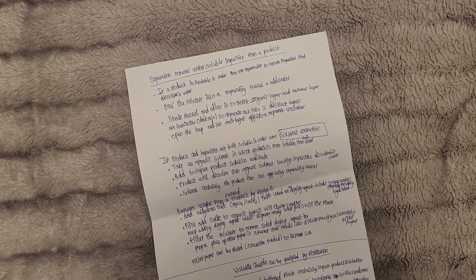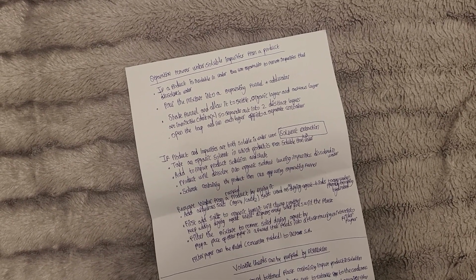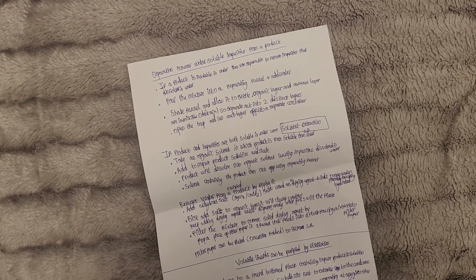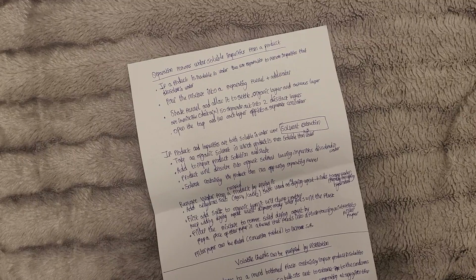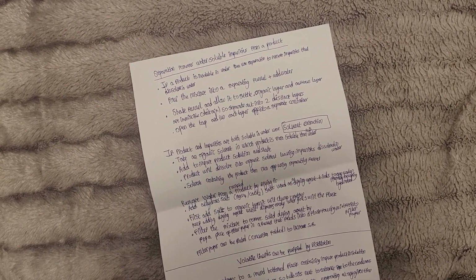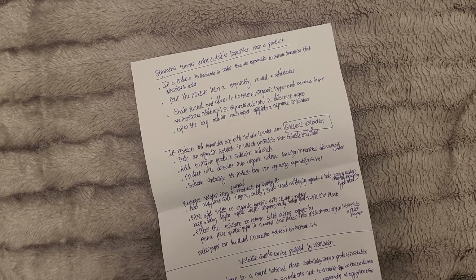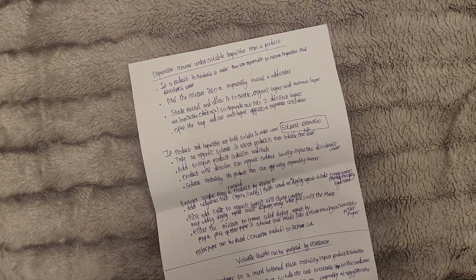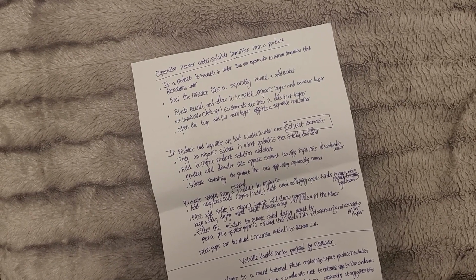However, if the product and impurities are both soluble in water, we use something called solvent extraction. First thing we do, we take an organic solvent in which the product is more soluble than it is in water. Add to the impure product solution and shake. The product will dissolve into the organic solvent, leaving the impurities dissolved in water. The solvent containing the product is then run off using a separating funnel.